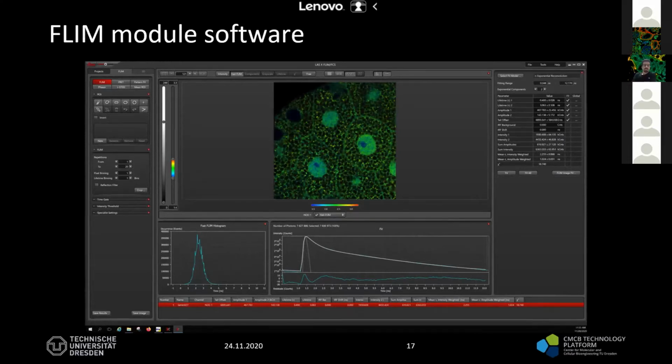We will see that. One thing that came up in the last few days was a question about the fast FLIM. What is a fast FLIM? That depends on which system you are using, but there are 2 explanations that I know. One is that when you acquire the data, you have the arrival time of the photons. When you average, you find the mean arrival time of the photons per pixel. You can estimate a kind of fast lifetime. It's not exactly the lifetime of your component, but a kind of mean arrival time of the photons that are coming.